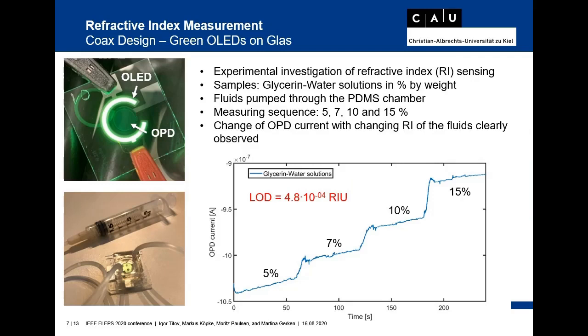Here we show a coaxial shaped OLED-OPD design with a round OPD and a surrounding green emitting OLED. To investigate the impact on its refractive index sensing mechanism with fluids, we conducted refractive index measurements to present the experimental evidence. For this purpose, we carefully prepared glycerin water solutions of defined values described in % by weight.